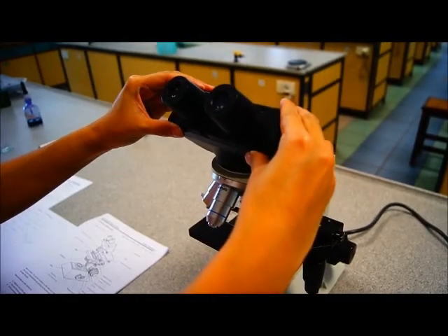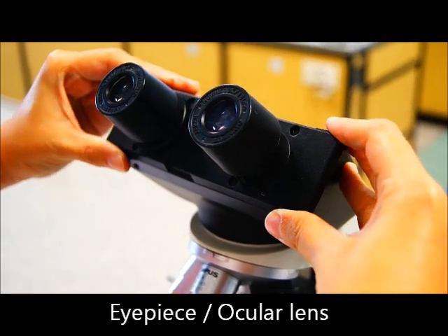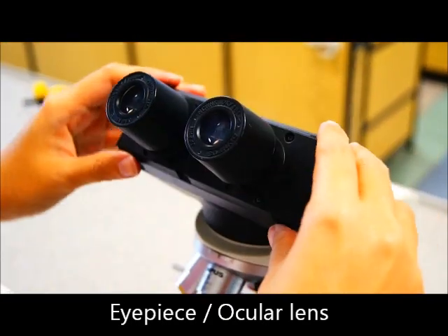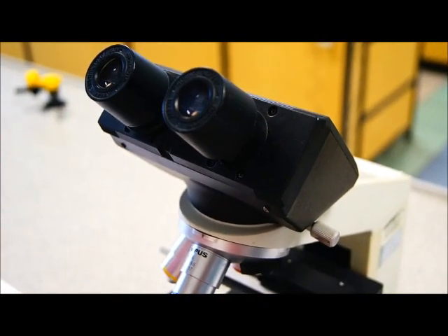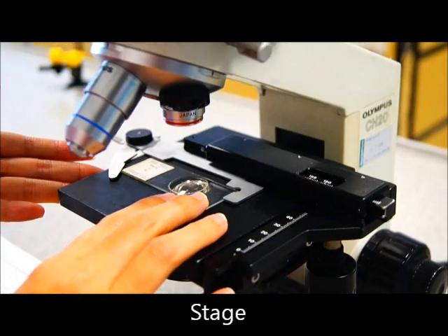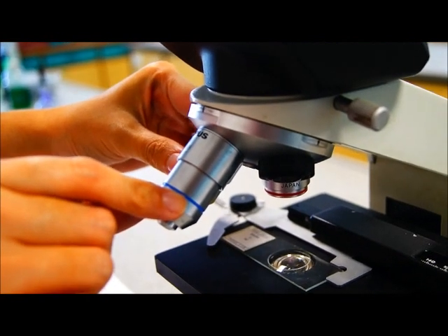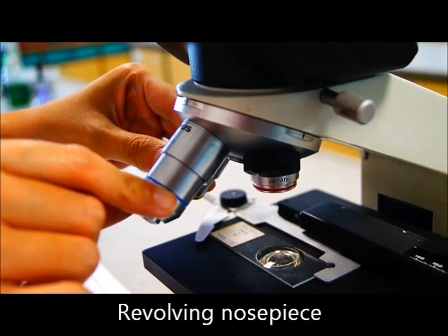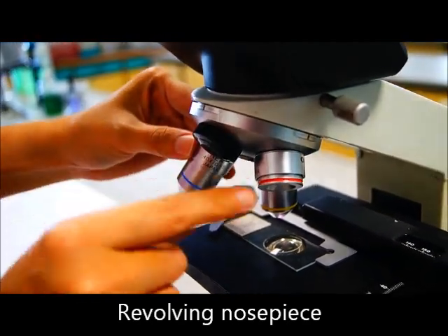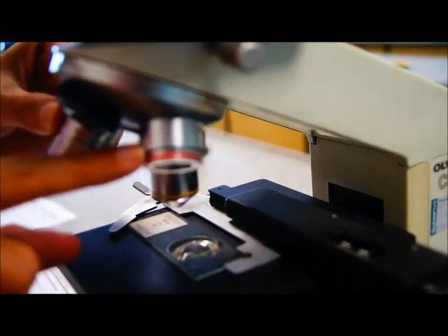This is the eyepiece or ocular lens. You can actually adjust it like this to fit your eye, the width of your eyes. Next, there's the stage here where we put the slide. This piece of equipment here is called the nose piece. It contains the different magnifying lenses. You can see that they are all labeled differently, telling you the magnification.